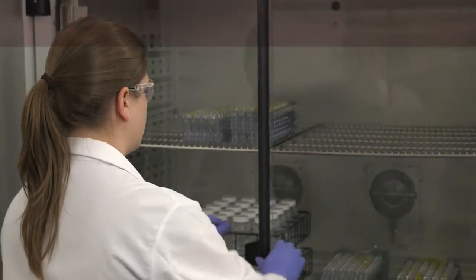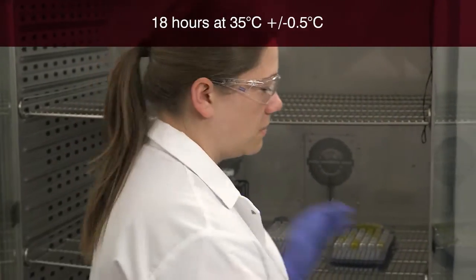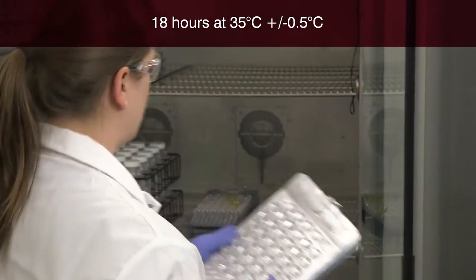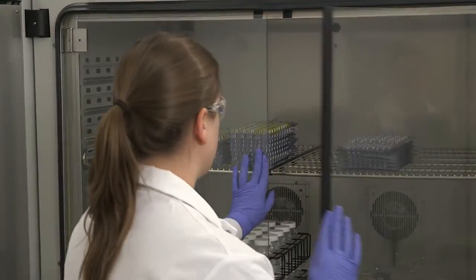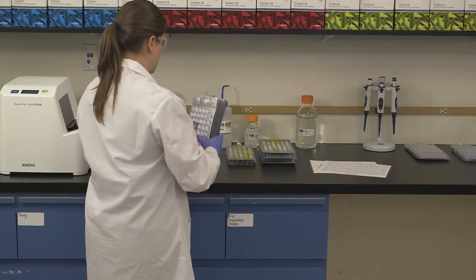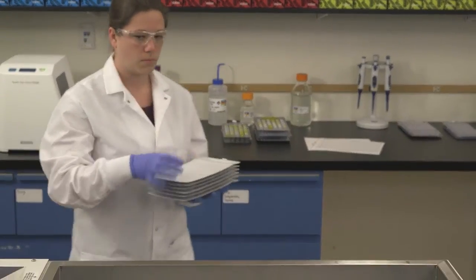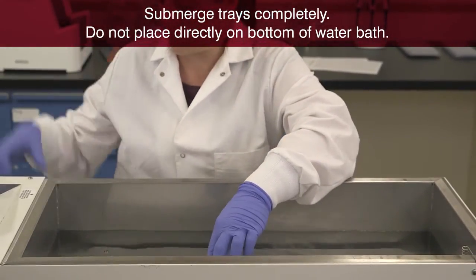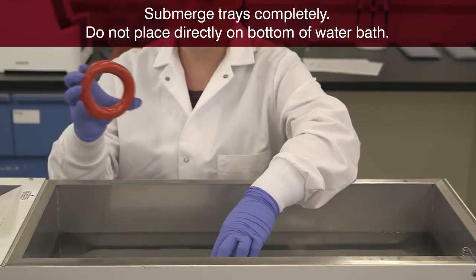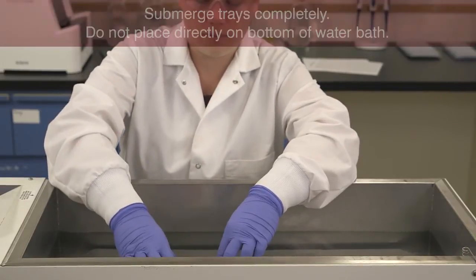Incubate the sealed tray for 18 hours at 35 degrees centigrade, plus or minus 0.5 degrees centigrade, or according to your local regulations. If incubating QuantaTrays in a water bath, do not place trays in a bag — trays can be submerged as is. Make sure trays are not touching the bottom of the water bath and make sure trays are completely submerged.